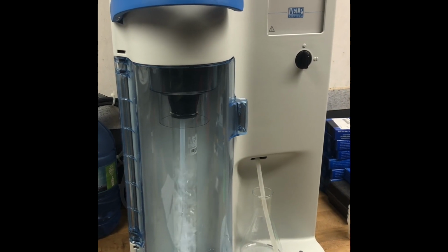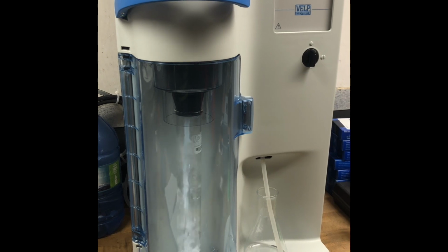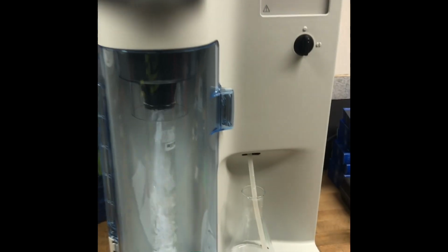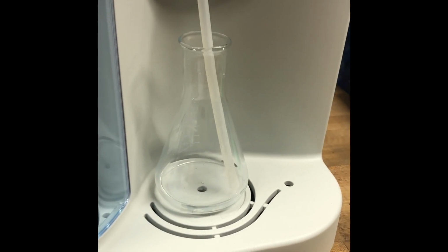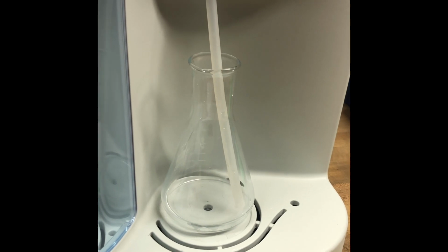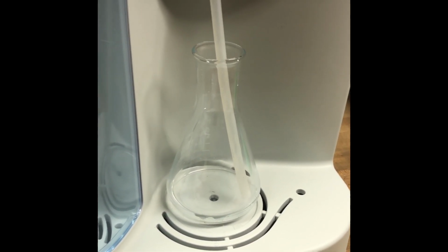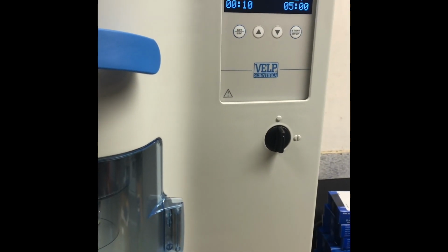Okay, so we're a minute in to the process, and we've got a really high volume of steam being generated there now. Okay, we're about halfway through the cycle, and you can see there's a steady flow of distillate being condensed into the distillate flask there now. Okay, I'm in the last few seconds of the cycle, and we're going to see the unit shut down.